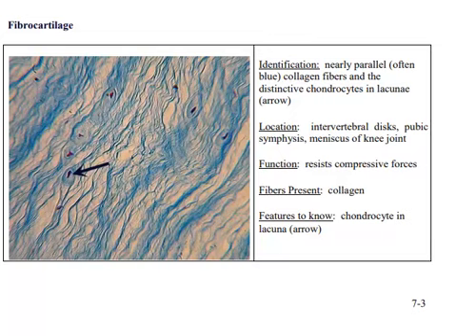The third type of cartilage is fibrocartilage, and again you have lacuna, and in this case they're laying down mostly just collagen. So here's a lacuna, and there's the cell, the chondrocyte, that lives inside of the lacuna. Cyte, the word C-Y-T-E, means cell. And all of this outer matrix is mostly just collagen. Collagen in this case is stained blue, but in actual fact it is colorless.